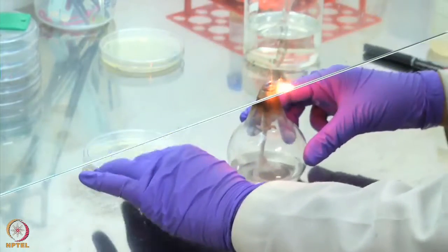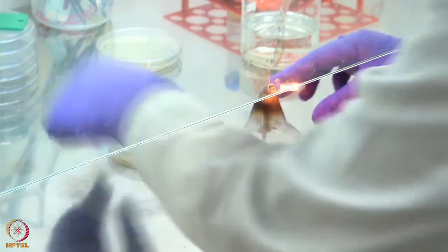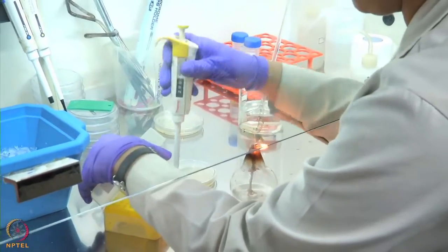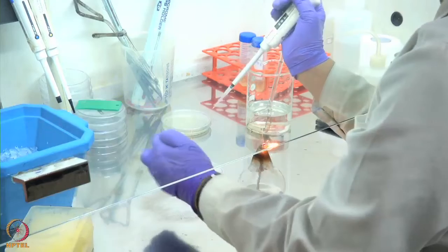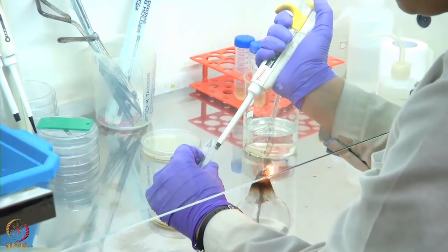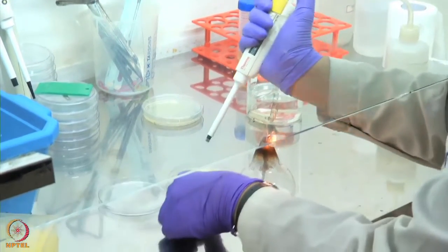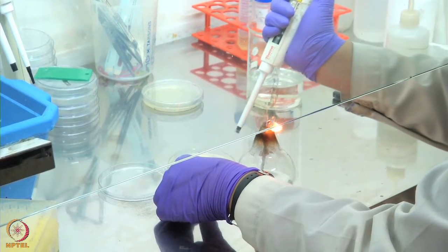Now I will take the negative control sample. Again, I will add in the form of little drops and spread it uniformly.